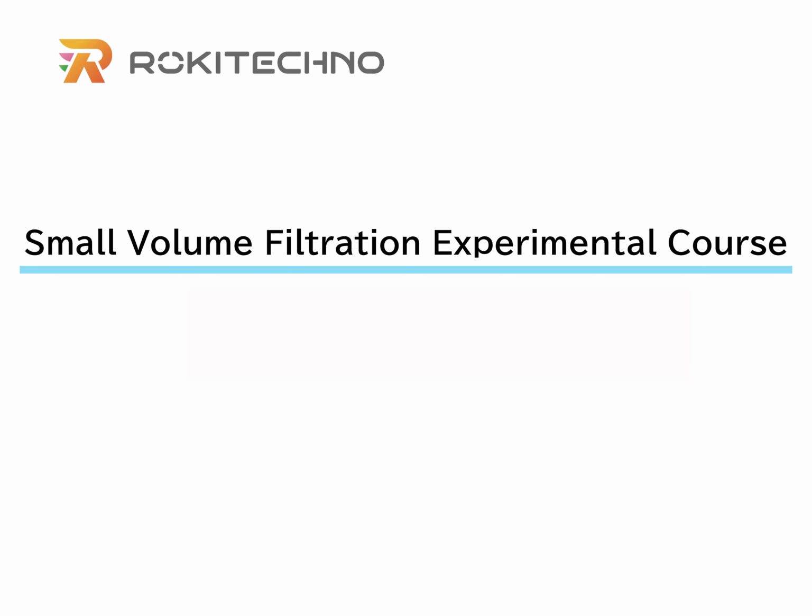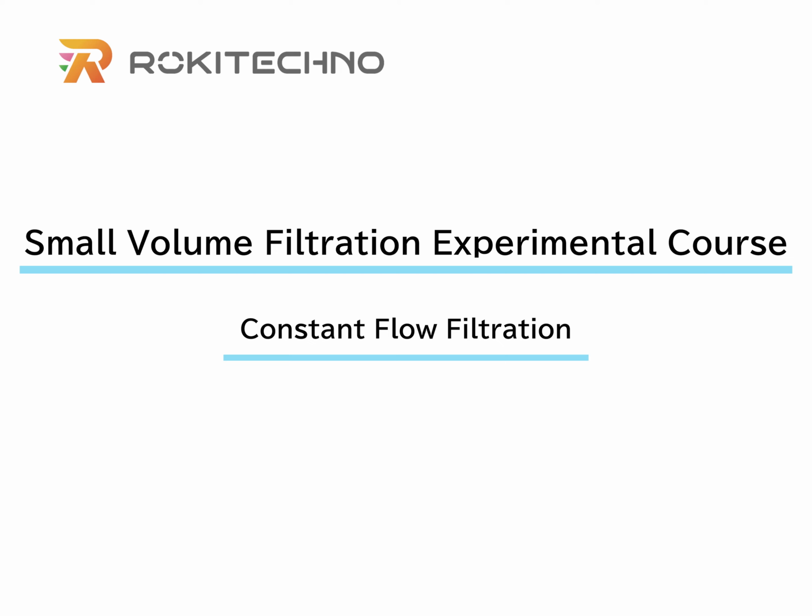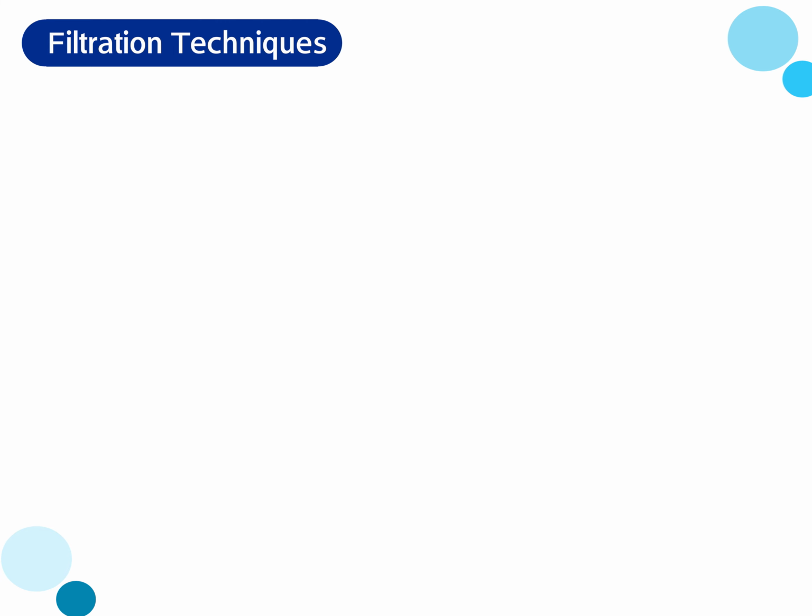In this video, we will explain the method of filtration experiments, using examples to illustrate the equipment needed, how the experiment is performed, and what results can be obtained. There are two main methods of filtration.